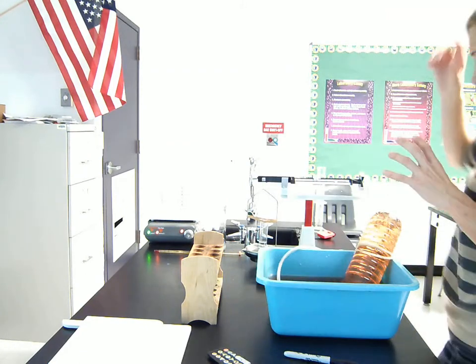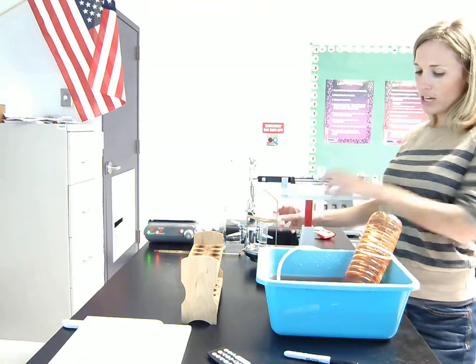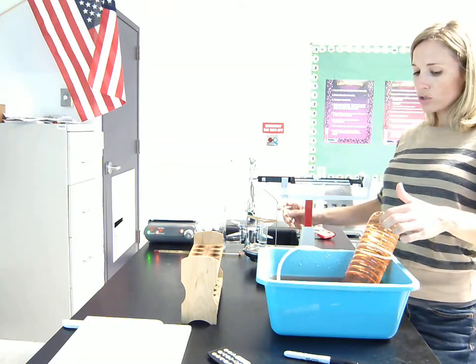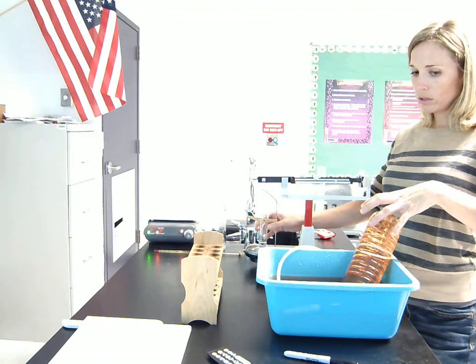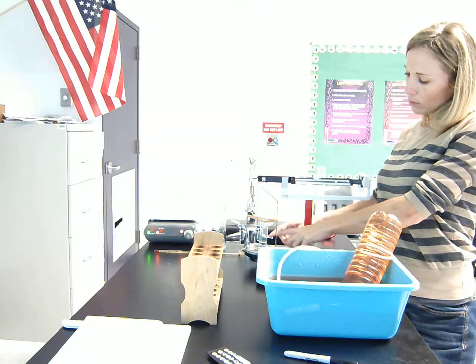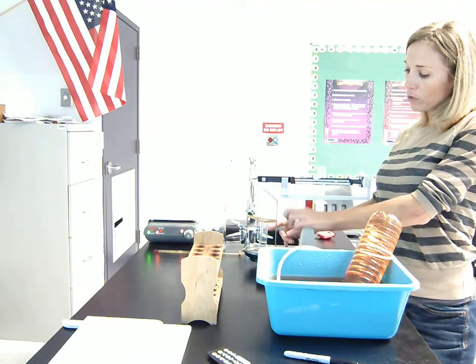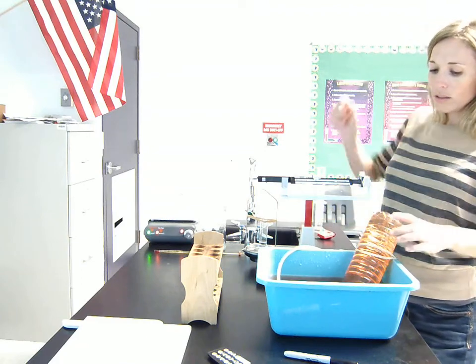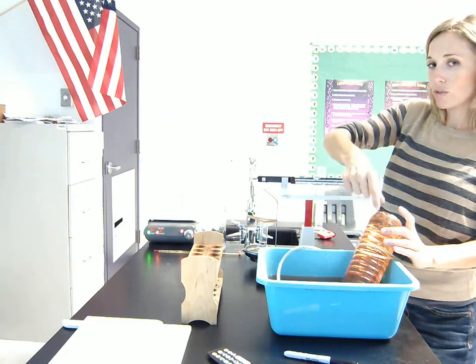Now, the only difference is the gas that's created from this reaction is going to be over here. So we're going to have part of our mass here and part of our mass in the test tube, right? So what we're going to do then is get the mass of what's left over in the test tube at the end. However much that mass goes down, that's exactly equal to how much gas we transferred to this bottle.